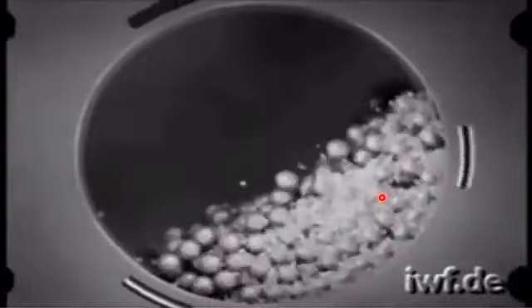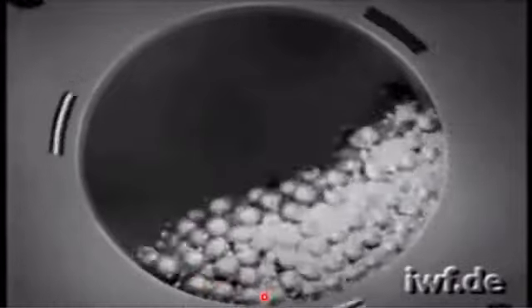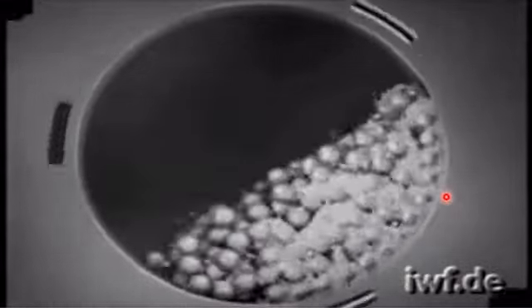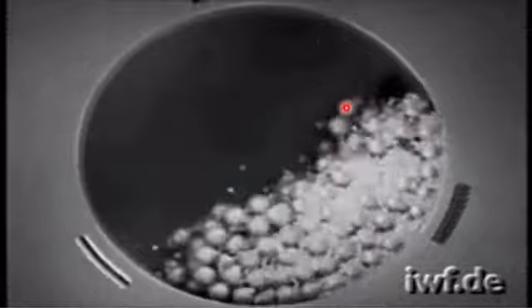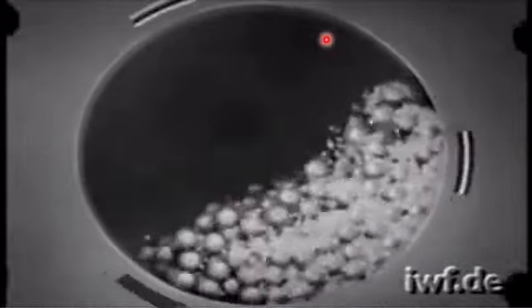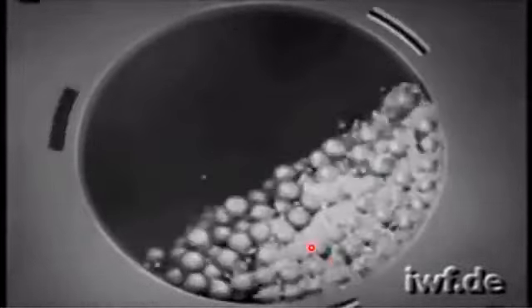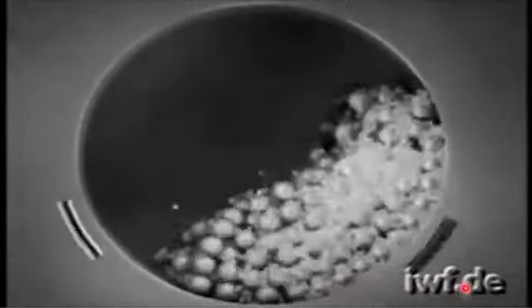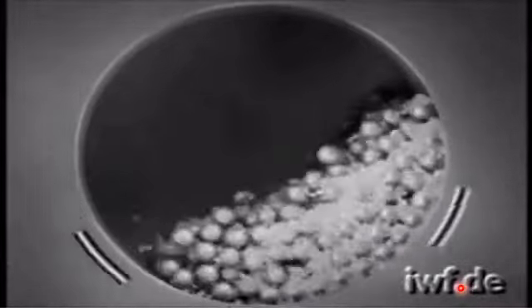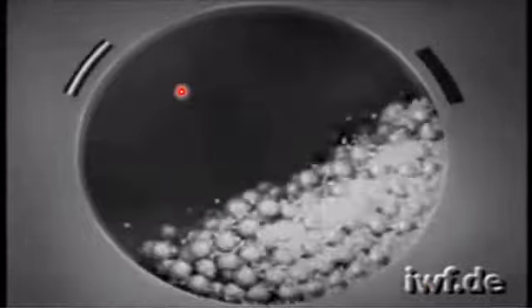So in order to avoid the impurity, the hollow part of the ball mill instrument is coated with manganese steel. There are also different types of coating materials which are used in the ball mill apparatus. But however, the most commonly used resistive coating is based on manganese steel.